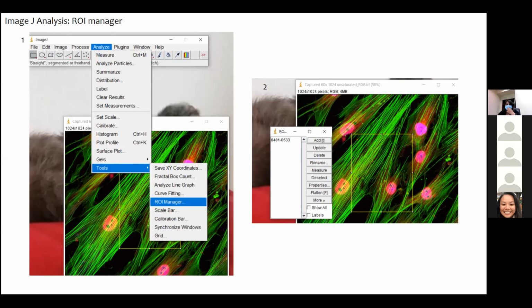and it's a minimal difference, but when it comes down to certain images, you can easily manipulate that difference to a higher fold. For example, if I say this is my treated, and look how much F-actin I have here because I treated it with either histamine or methacholine or any other thing that makes F-actin just stand out.